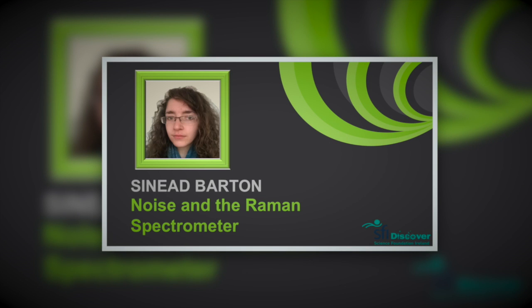Tonight to present my thesis, Noise in the Raman Spectrometer. So first of all, what is a Raman spectrometer?